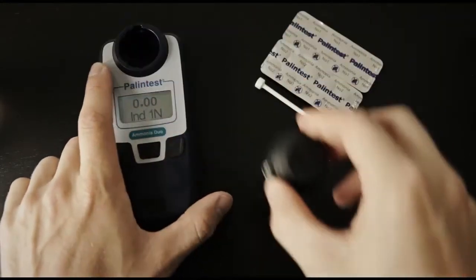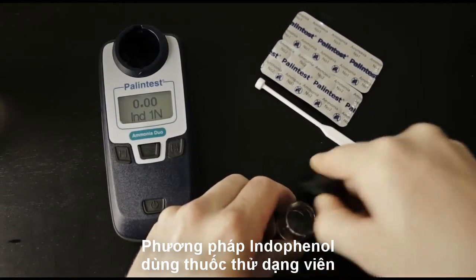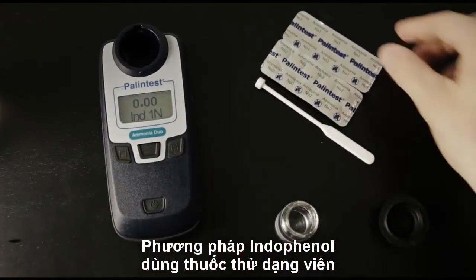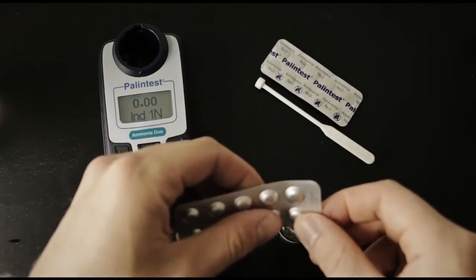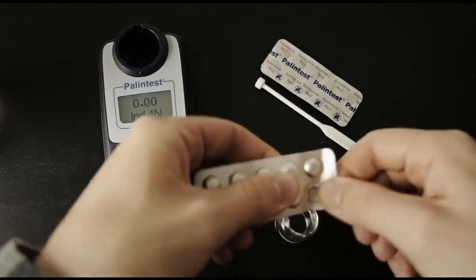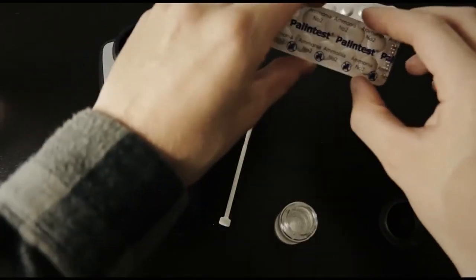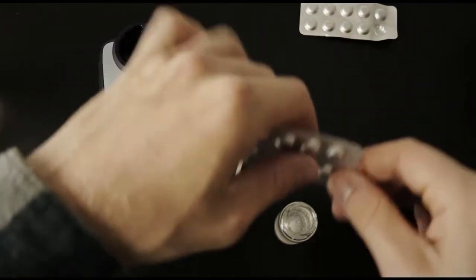Take the cuvette out of the instrument and add one Ammonia No. 1 tablet, also known as AP152. Also add one Ammonia No. 2 tablet, also known as AP153, to the cuvette.